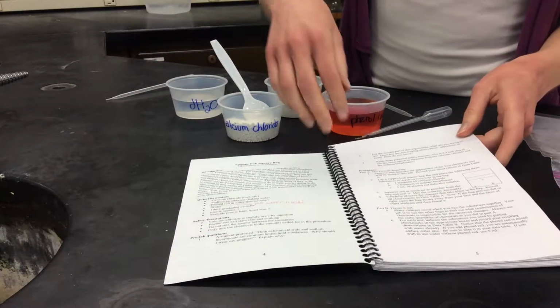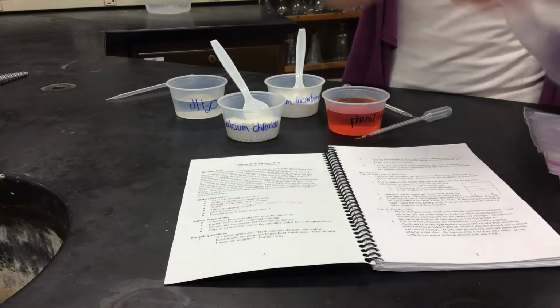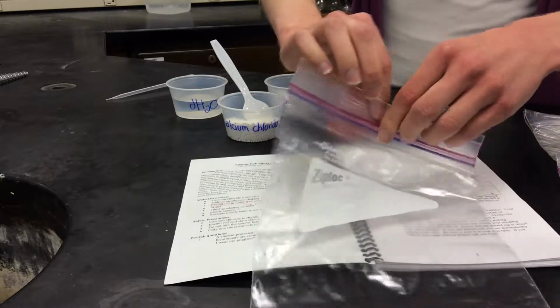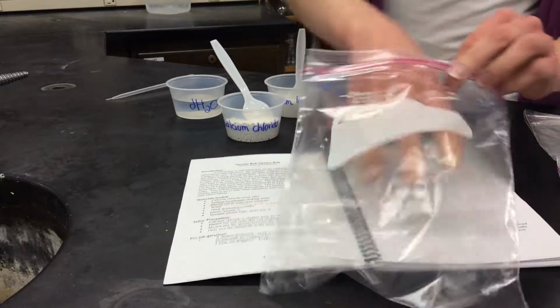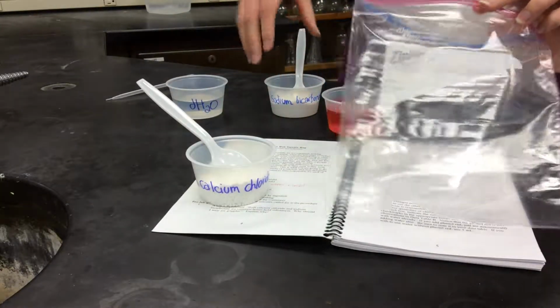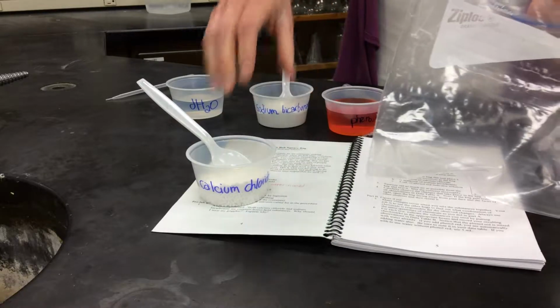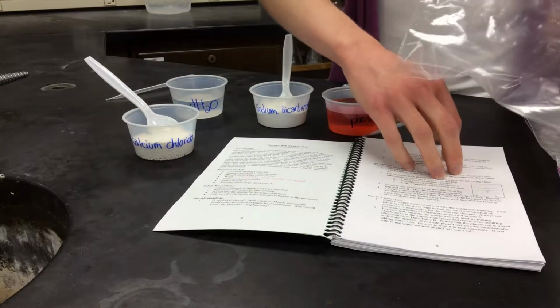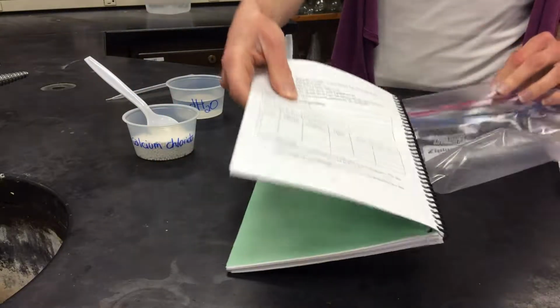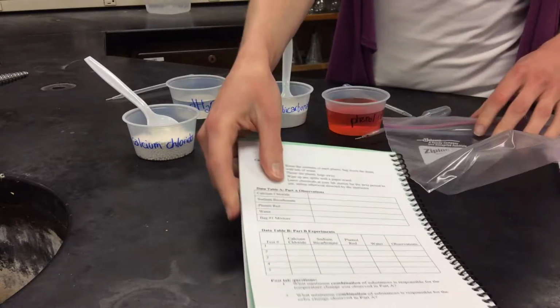Now, the procedures tell us that what I need to do is take a Ziploc bag, so I have one of those right here, and I am going to put in this Ziploc bag calcium chloride and sodium bicarbonate and some phenol red. And all you need to do is observe what happens and write down your observations right here where it says bag 1 mixture.